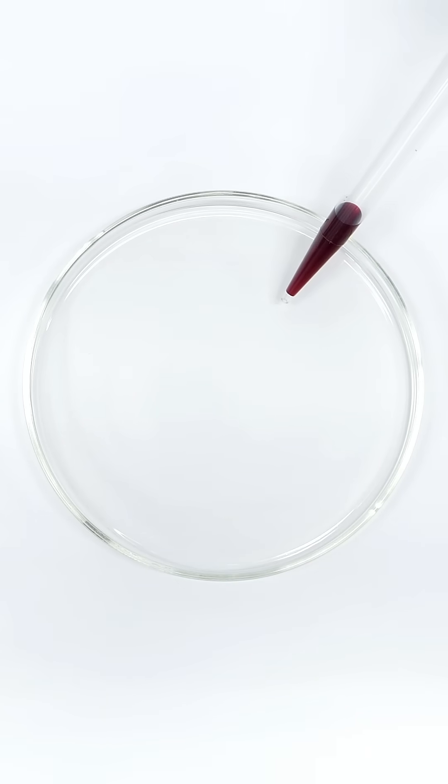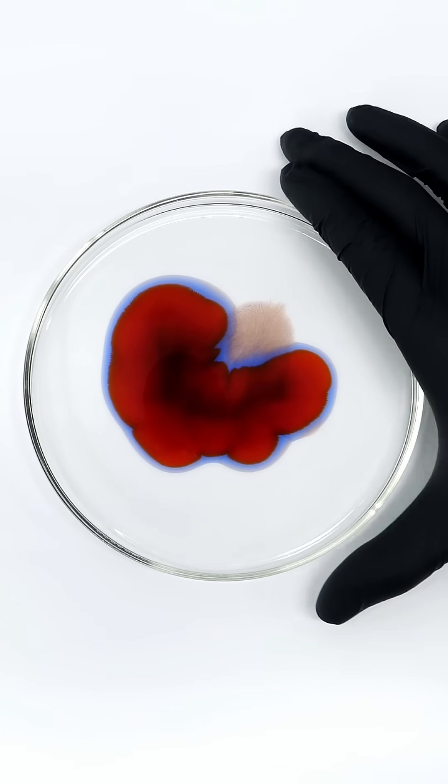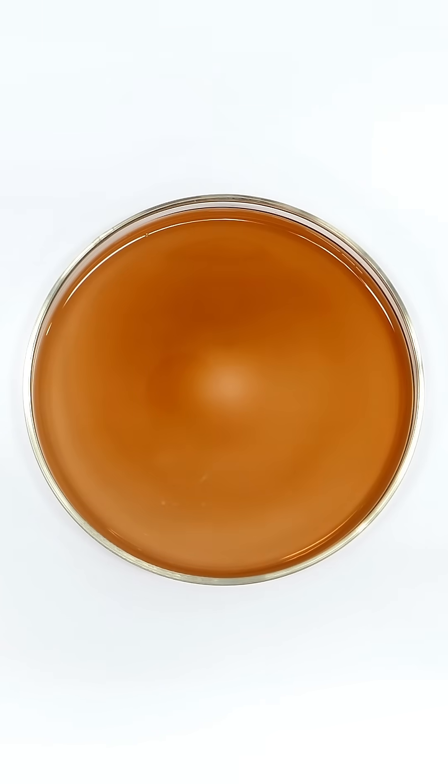Now, I can add the final ingredient, which is some ferroin indicator. I also have to mix this around until it looks pretty even, and after that, I just have to wait.